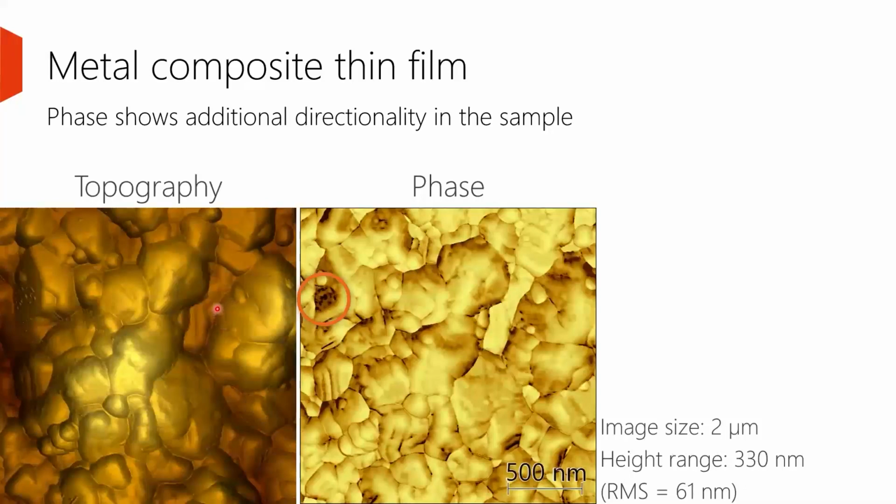Yes, there are two small particles. Is that just the same material? Likely not, because they have a different phase. Also there are some particles that are darker. What you also nicely see in this sample is that the phase information contains a lot of topographical information. So all these lines, that's not because there is a different tip-sample interaction. There is just a different topography, and because the feedback is there, you also have a phase contrast. Whether this slightly brighter yellow is significant, that's a good question. It could be some damping, but it could also be saying something about sample differences.